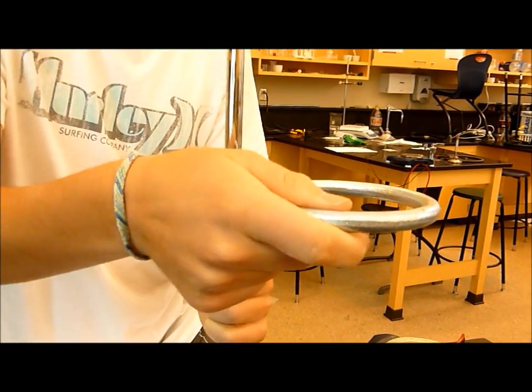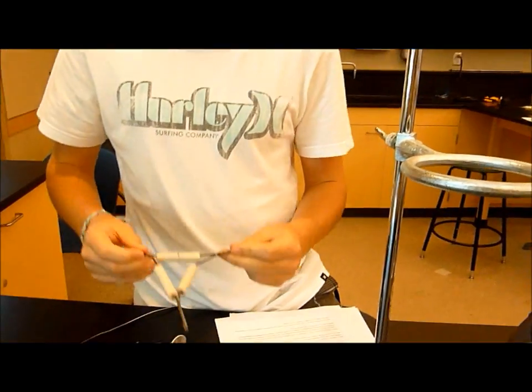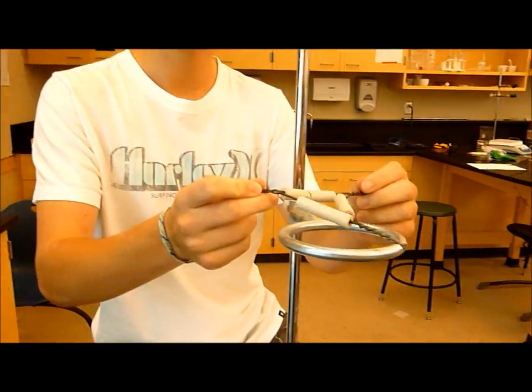and then screw it back until it's nice and secure, so that it won't slide up or down. Then, what you need to do, is take your clay triangle, and put it on the ring stand.